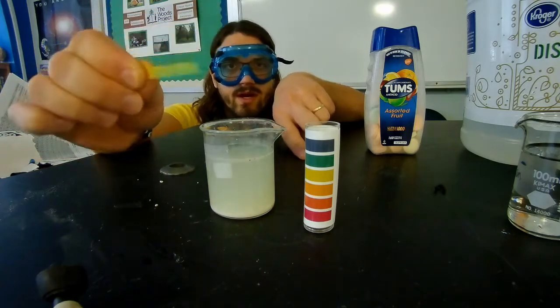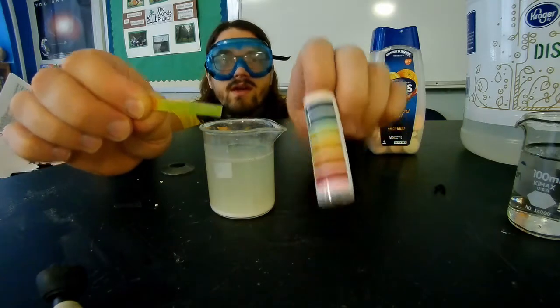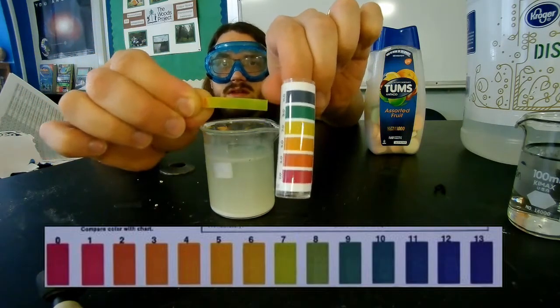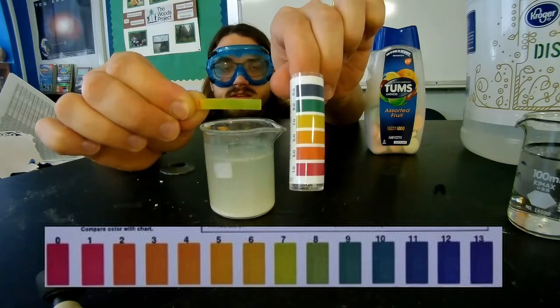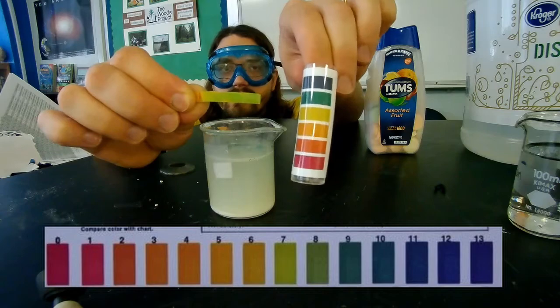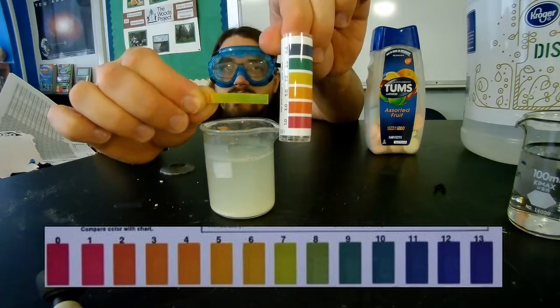But after it dried off a bit, the pH of this one, the Tums, has changed again. So there you go. I think that's a better official pH. So what do you guys see? And does this make this an acid or a base? Remember, as our last reminder here, if it's above a 7, it's a base, and if it's below a 7, it's an acid.